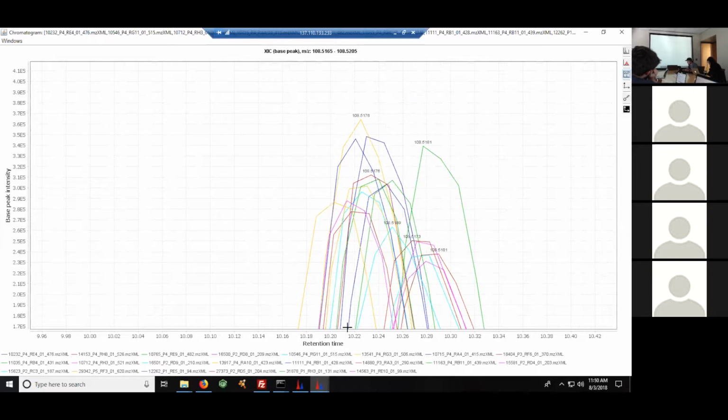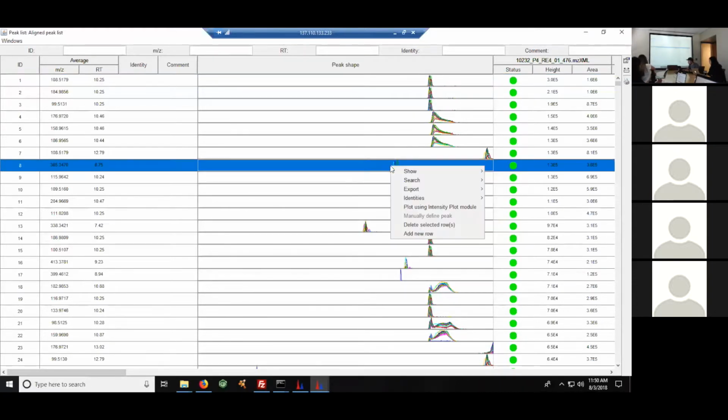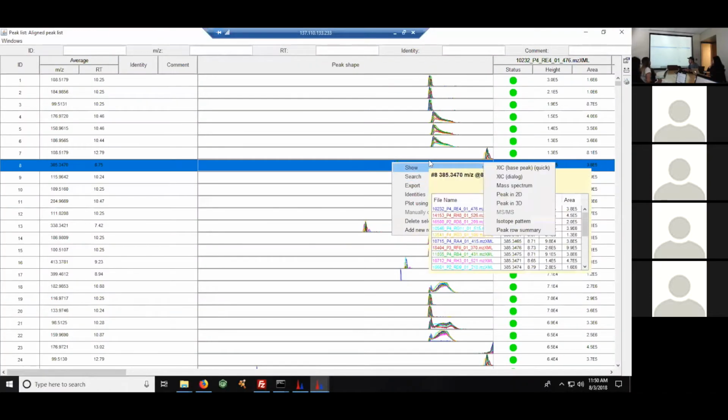Okay, thanks, Ming. So here the retention time shifts were, and that's the difference for the 0.1. The apex of the peak? Yeah. Okay, but anyway, I think this gives you a good way to visualize this. So for example, in this example here, there seems to be a bigger retention time shift, but it was still captured.